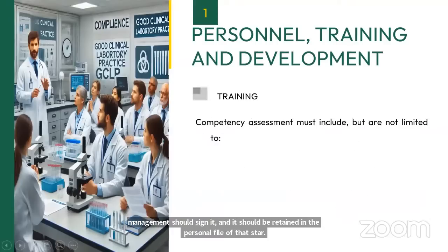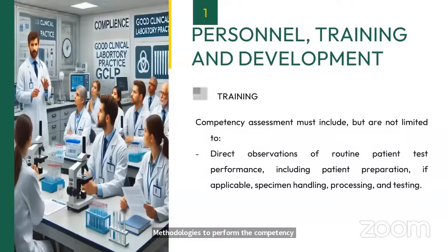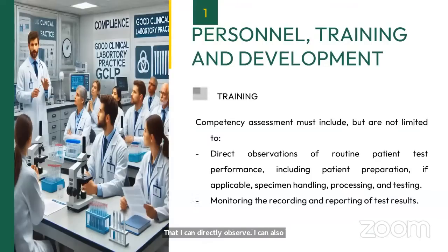Competency assessment, how you should perform it. There are various methodologies to perform the competency assessment. It includes direct observation of routine patient test performance. I can directly observe how a staff member is working, how they are collecting the samples, how they are processing the samples, how they are resulting the report, how they are handling the specimens, how they are discarding the waste, and how they are using the personal protective equipment. I can also observe how they are recording and reporting the test results. Once the results are generated, they have to record and report them, so I can observe those activities also.